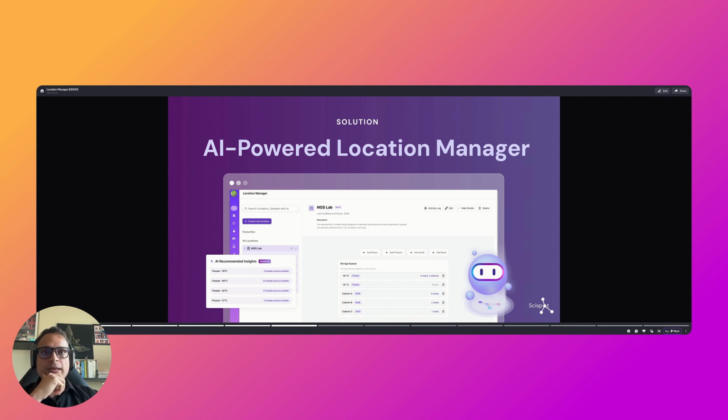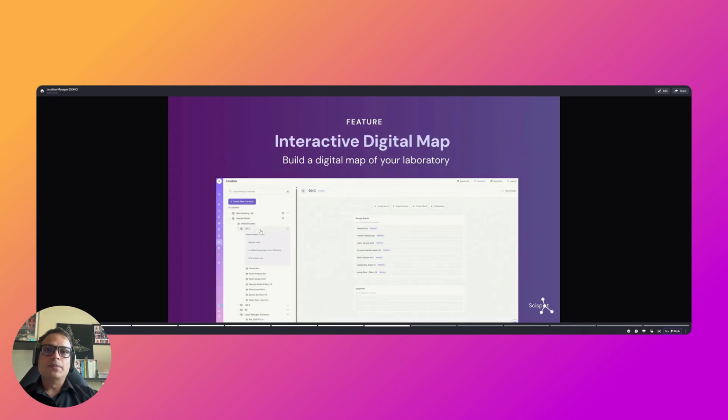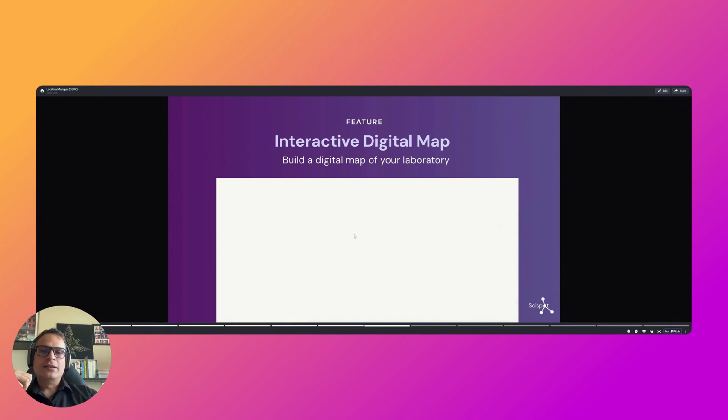And getting those real-time notifications from the system is really helpful because then I don't need to think, and I'm not prone to any manual errors as a human being, right? I can get suggestions from the AI and I can find the right location to store my samples within the platform. So yeah, those are some of the benefits that we are seeing when we convert this kind of deep freezer management problem into AI assisted suggestions at various stages of the user journey for a wet lab or a CLIA.